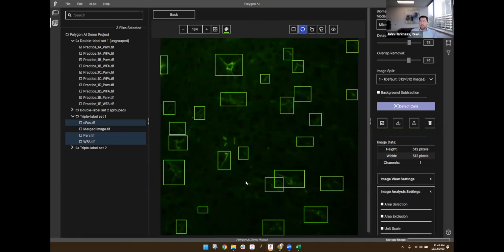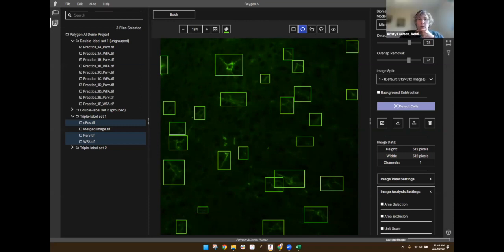That's a good way to import an ROI shape. But additionally, the feature that I was mentioning is the ability to import that straight into the area selection or save some of those shapes. So keep an eye out for that. I don't have an ETA on it, unfortunately, but certainly sometime into 2024 now, given that we're at the end of the year. We're always adding new little features and functions.